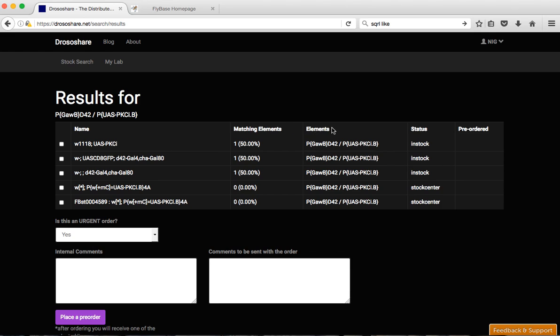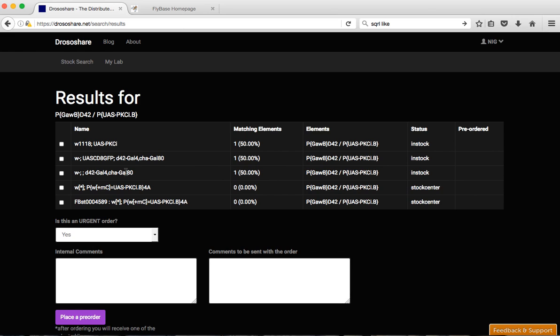So matching elements and elements are not yet working. You can see here the status, it's either in stock or in stock center. In stock means elements which are actually in stock of DrosserShare participants. So this will come from labs and the last two ones will come from stock centers.